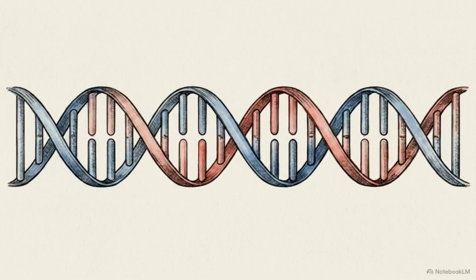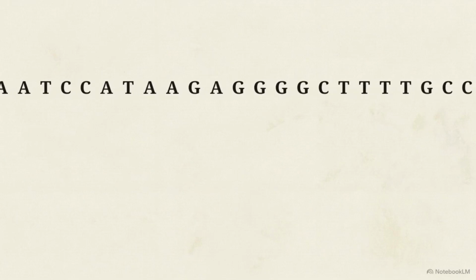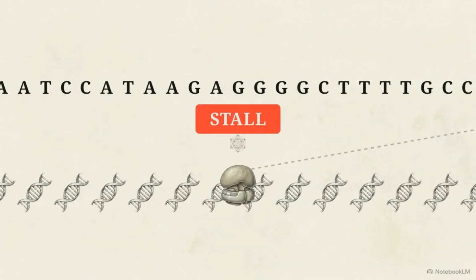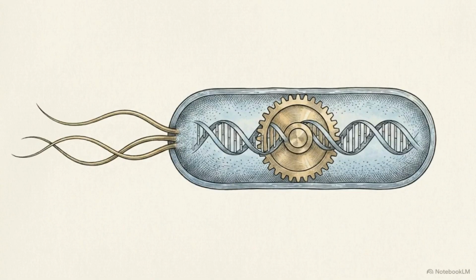Upgrading the biological hardware solves structural limits, but it cannot fix software conflicts hard-coded into a species' DNA. The genetic code might be universal, but dialect matters. Human DNA relies on specific nucleotide triplets, codons, that bacterial factories rarely use. When the bacterial ribosomes hit these rare codons, they lack the right biological tools to read them. These genetic software bugs stall the assembly line, bringing production to a halt. To clear the error, scientists use custom-engineered Rosetta bacterial strains. These hosts come preloaded with a patch of the missing translation software, allowing them to read human code fluently.